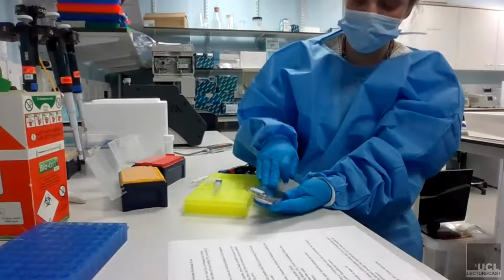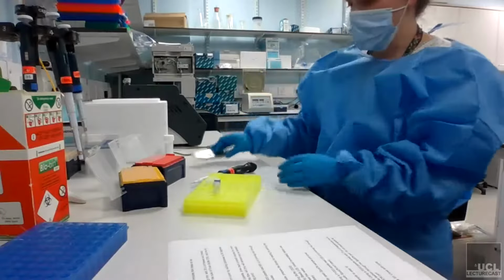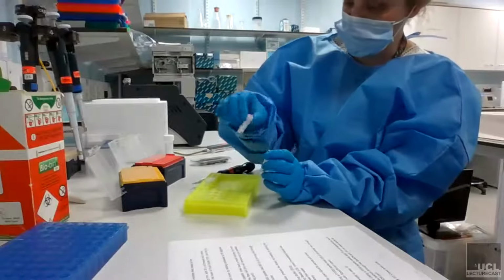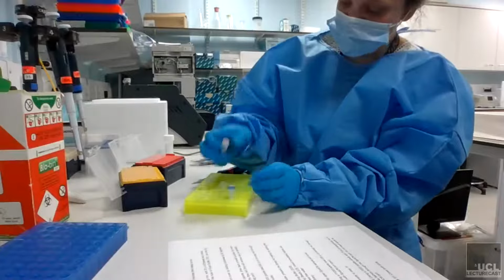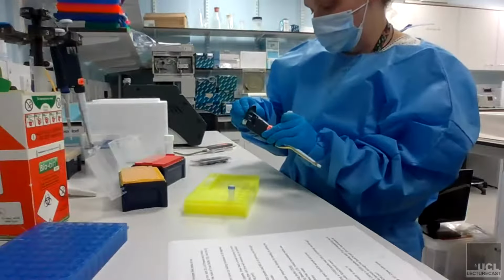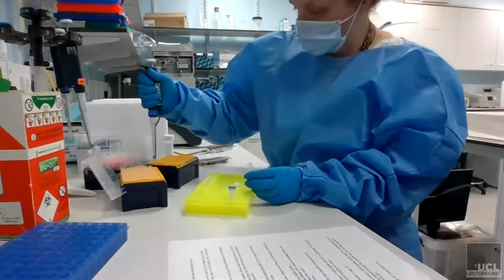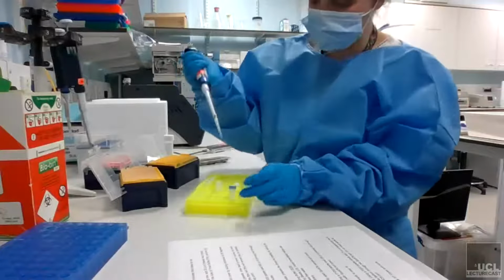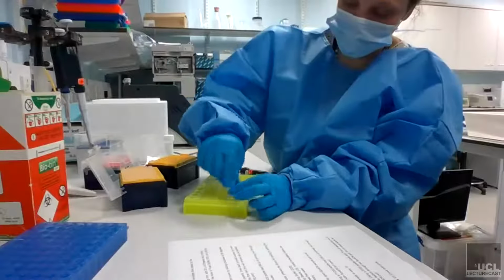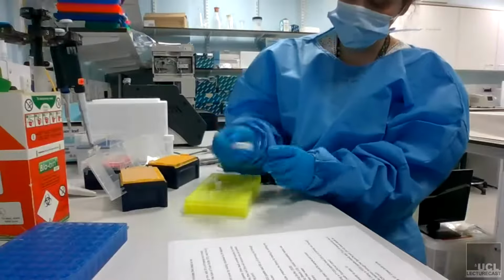But before we start sequencing, we need to flush out all of the storage buffer with a sequencing buffer, and that's what we're going to make up now. We've got flush buffer, which is the blue lidded one, and flush tether, which is the pink or purple lidded one. What you need to do is put 30 microliters of the flush tether from the purple lid tube, mixing obviously and spinning down, into the flush buffer tube. Each time you run a sequencing run, you'll use a whole tube of this. So you just put a small amount of the flush tether into the flush buffer.